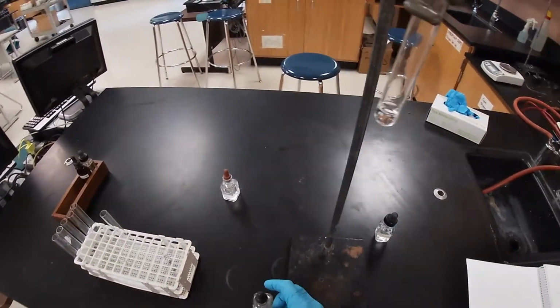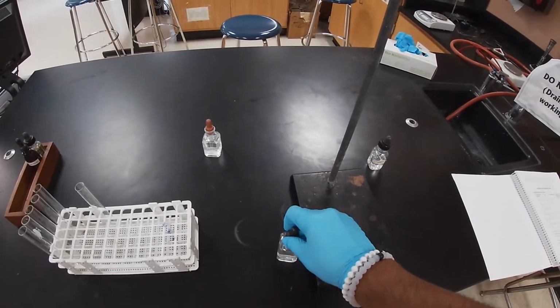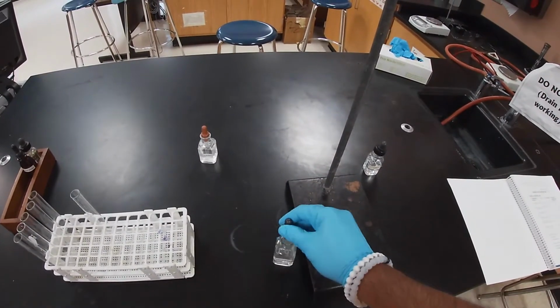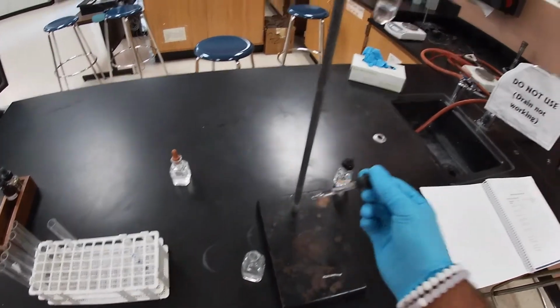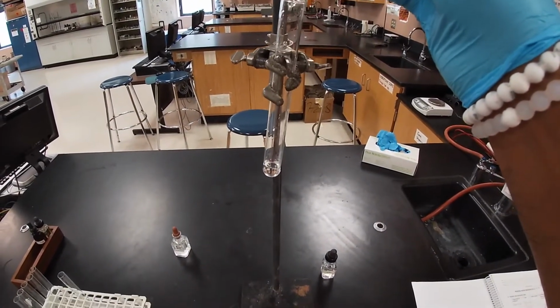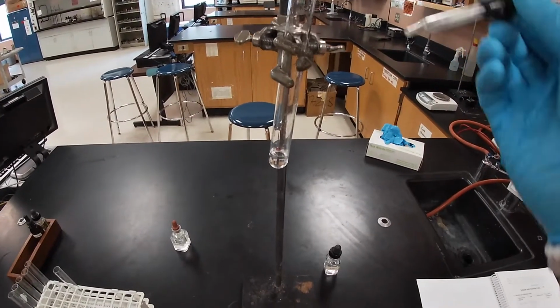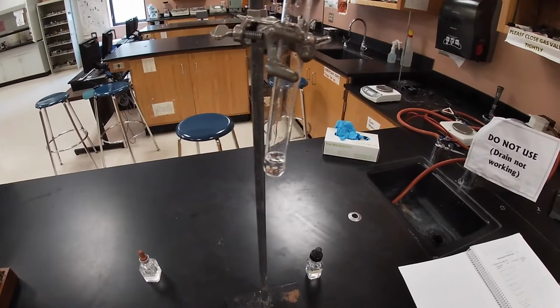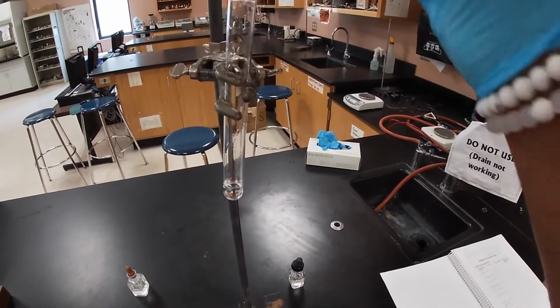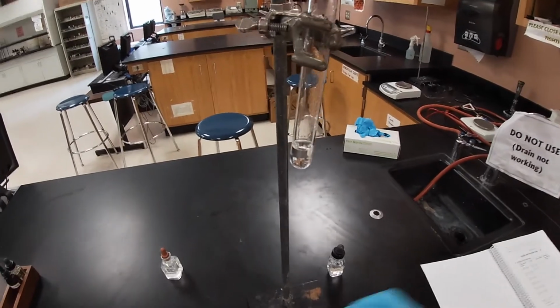Now that I've added my calcium nitrate, I'm going to set it aside, and now I'm going to get my sodium sulfate, and add it dropwise first and see if anything occurs. I've added a few drops, nothing has happened, so I'm going to add another dropper full, and nope, nothing happened.